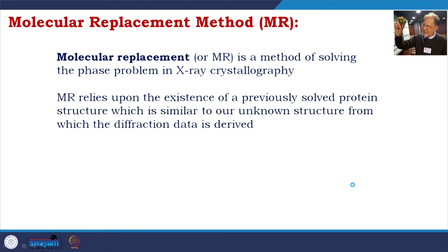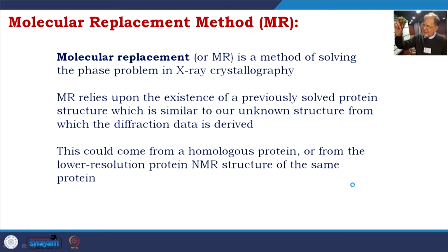This process was developed by Michael Rossmann. MR relies upon the existence of a previously solved protein structure which is similar to our unknown structure from which the diffraction data is derived. This could come from a homologous protein having similar properties to the protein you are working on, or from a lower resolution structure of the same protein.